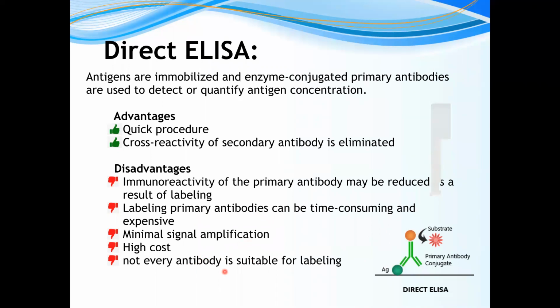And not every antibody is suitable for labeling. So that means that there are not many antibodies available for the target. So it has a very limited choice for the detection of the target.